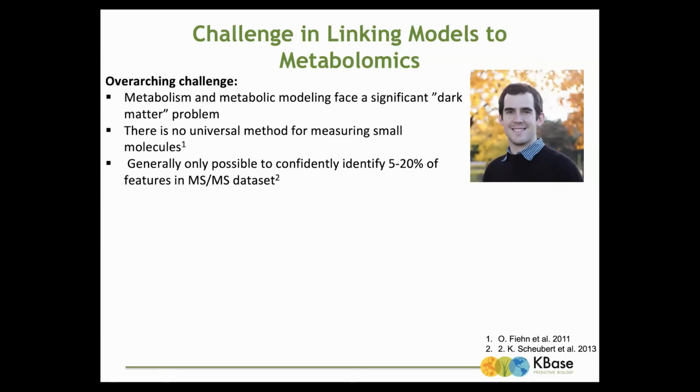There's no universal method for measuring small molecules, so that's a contributing factor to this challenge. I talked about FTICR versus LCMS, MSMS, and FTICR can be LCMS if you put some separations in front of it. Generally, it's only possible to confidently identify 5 to 20% of the features in an MSMS data set. So if you don't have MSMS, you're not confidently identifying anything. You can get a molecular formula with a fair level of confidence for a large fraction of the peaks with FTICR. That's one of the advantages of that method: the highly fine resolution on the masses gives you a pretty good idea of what the formula is.